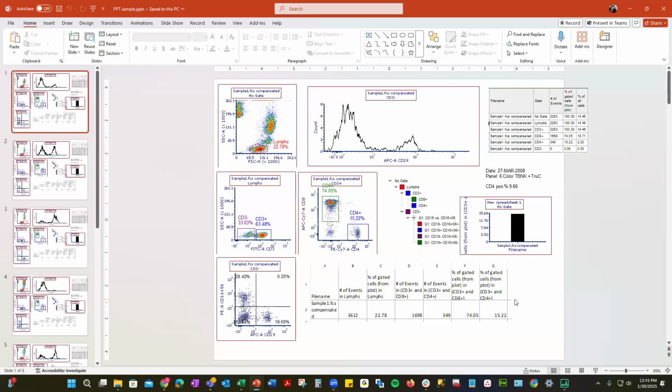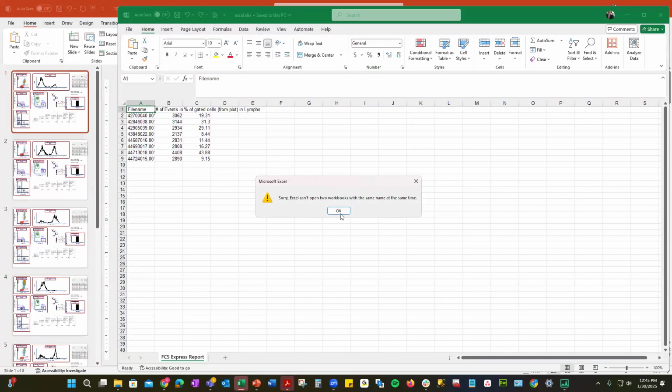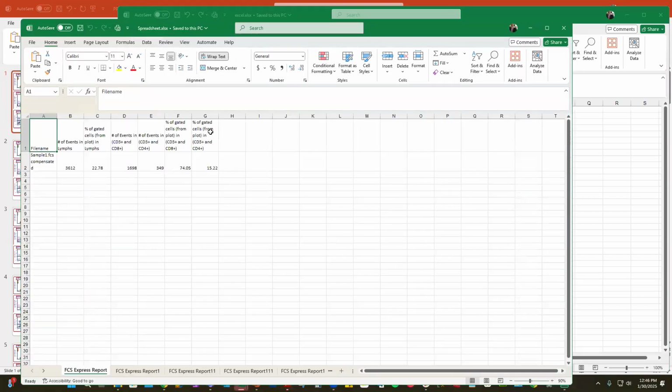All right, now everything pops up because I told it to. So here we go. Let's go with the Excel first. I mentioned to you the function of Excel having just the spreadsheet. And as you can see here, what it did was create a spreadsheet with each of the different tabs for each of the samples. Right? So there's sample 3, etc. And you have the statistics there.